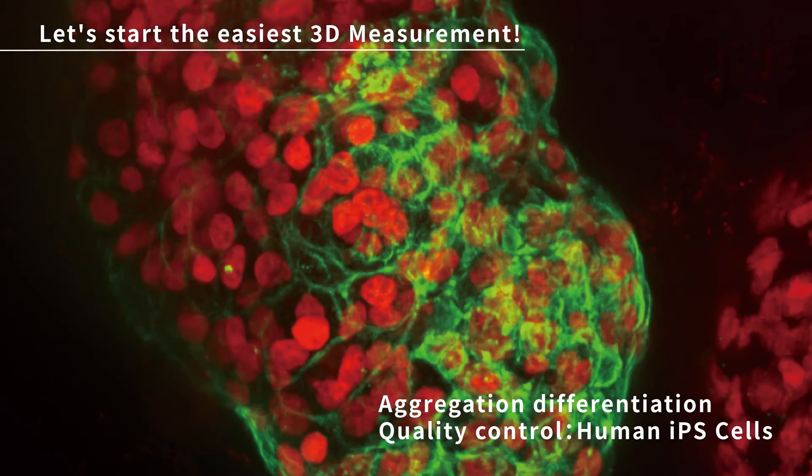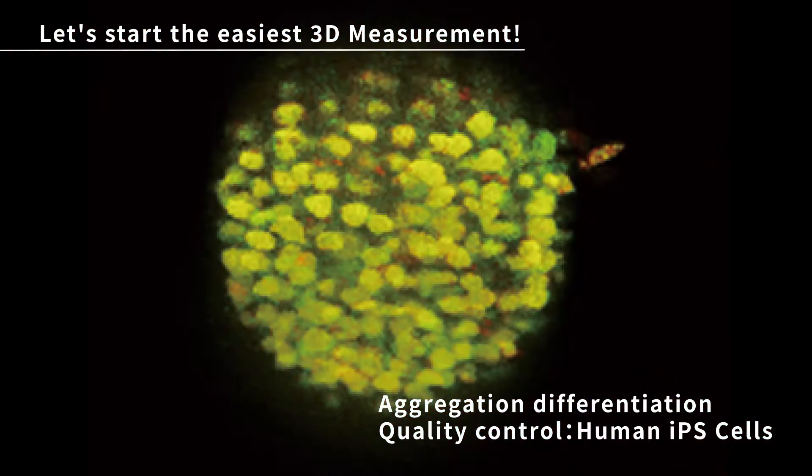Cell Voyager CQ1 is flexible and capable of a variety of applications.